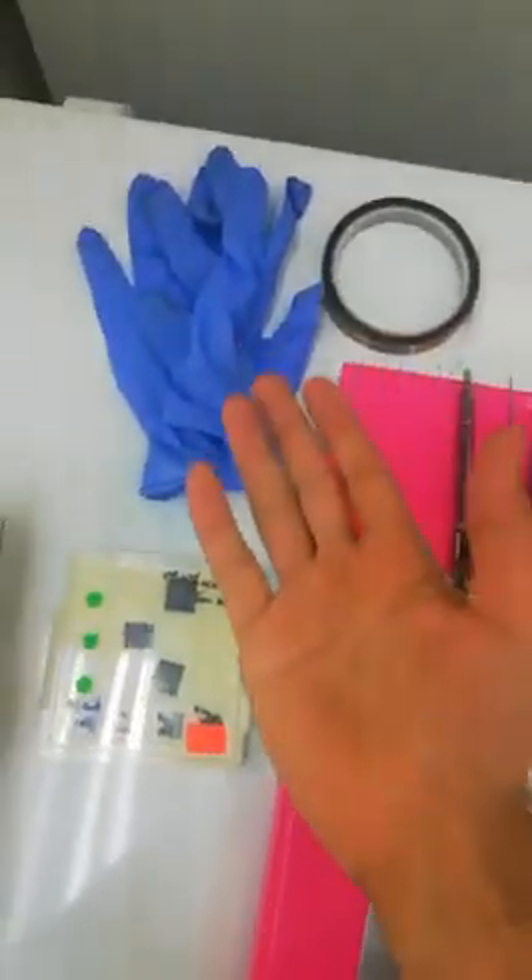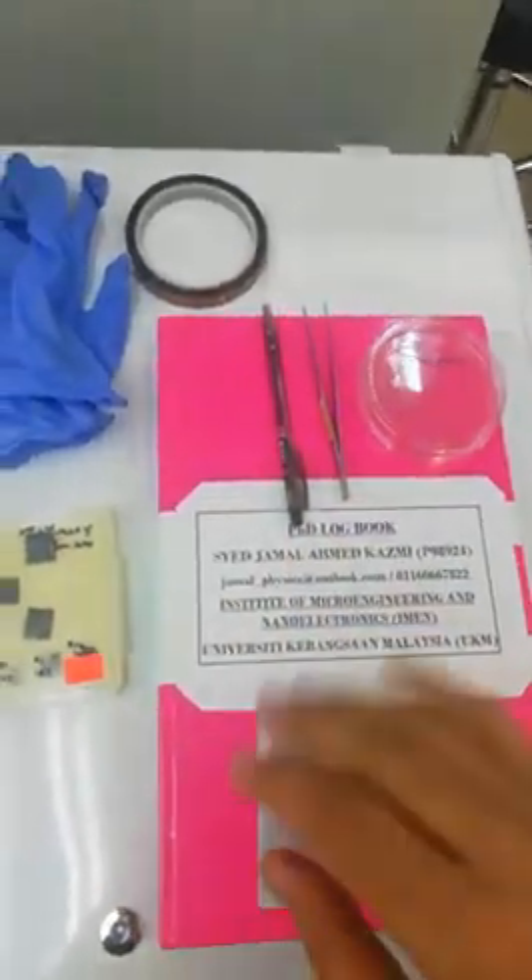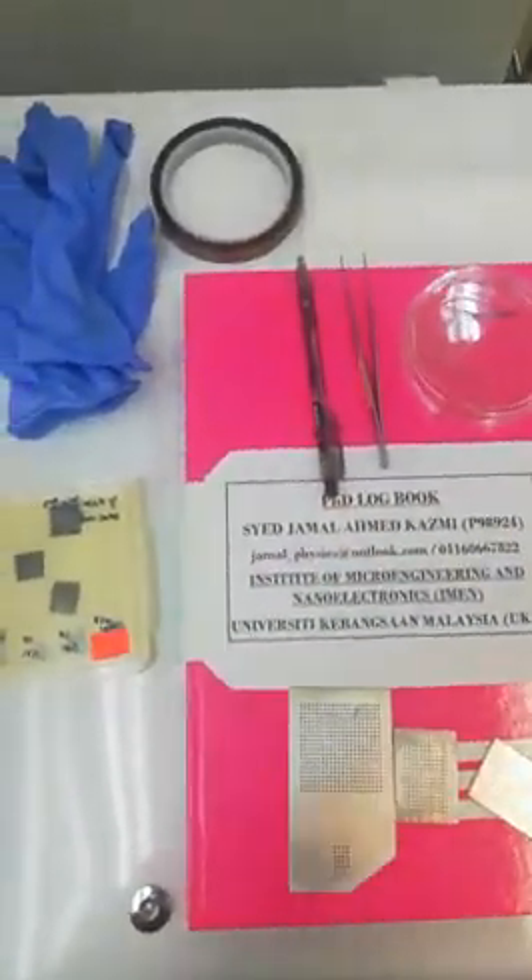Make sure you have gloves, a mask, and heat resistant tape to avoid any contamination from your silver nanowires. We are going to enter the lab where we have the nitrogen setup.